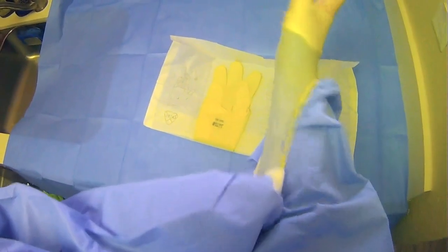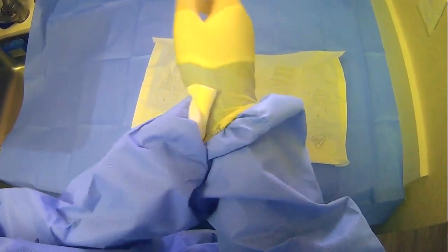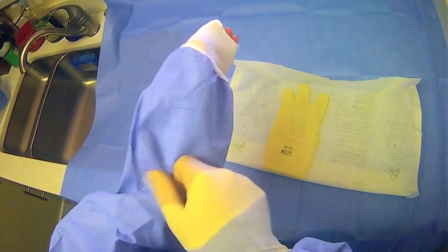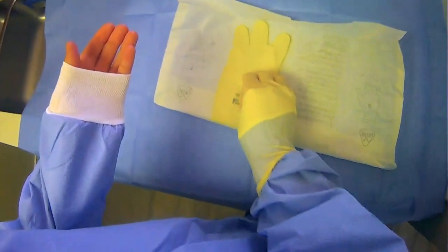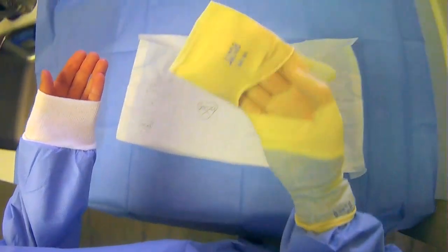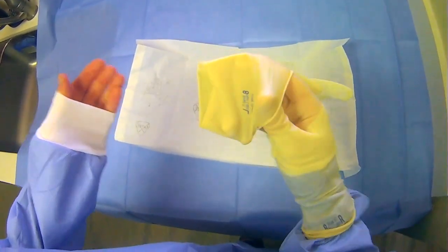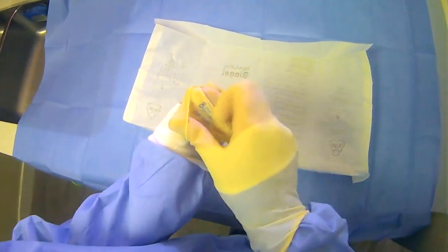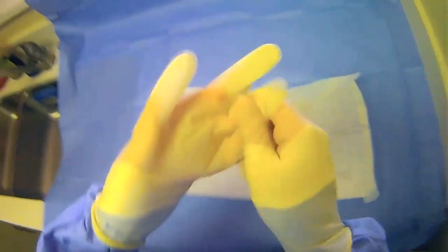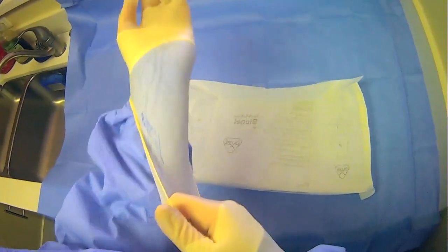and then you can adjust, and now you have one hand in, and now it will be a little bit easier. You can expose your fingers on the other hand, grab the glove like so, putting your hands here, a similar technique to what we've discussed before, and then you can just slide your hand in here, and now you're scrubbed in.